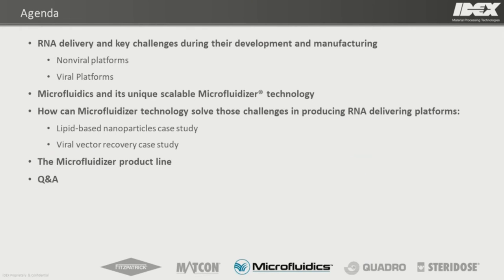Just a brief agenda for my presentation today. I'll give you a very brief introduction to RNA therapeutics and its delivery. I think everyone here knows better than me. And then I'd like to talk a little bit about some common challenges and requirements during the manufacturing of RNA platforms, and then move on to introduce you to our company, Microfluidics.